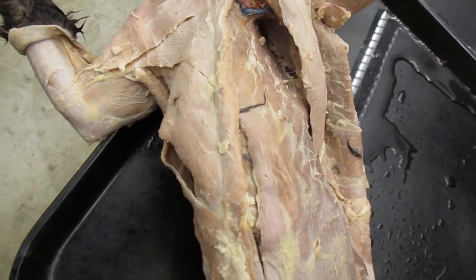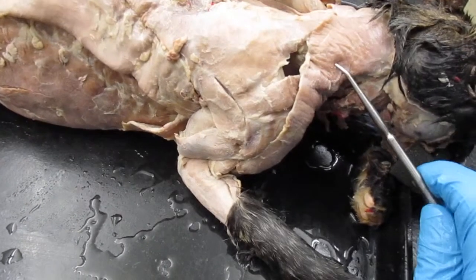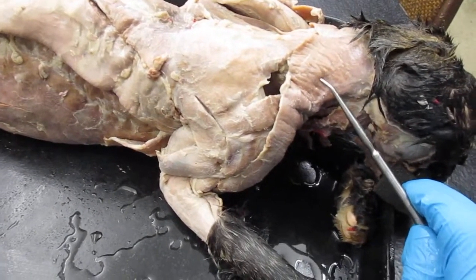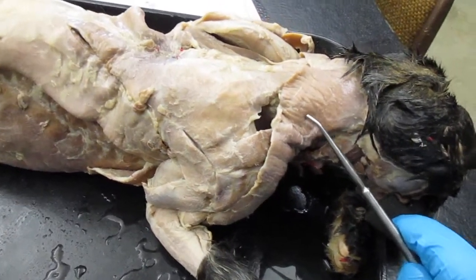Let's move on to the trunk muscles. I want to show you these trunk muscles now. So let me flip this cat over here and turn it around. And I'm going to show you the trapezius muscles first. So right here, we can see the clavotrapezius right here. Hopefully you can see the clavotrapezius right here.